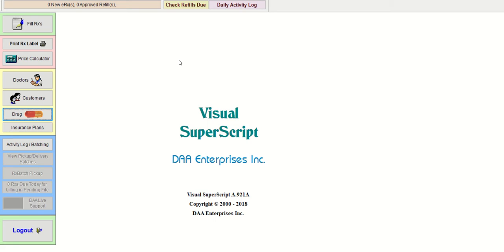COM103. This is lab 22, and we're on page 127. So in lab 22, the example is compounding. So that's just non-sterile compounding. So for us, creams, ointments, suppositories.